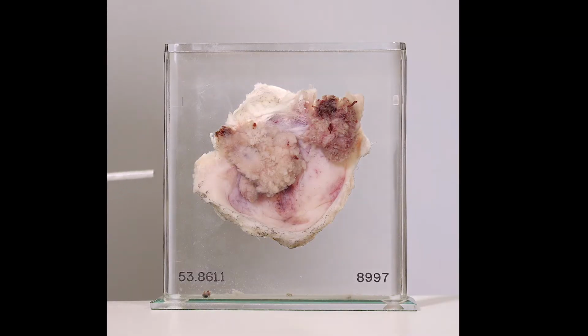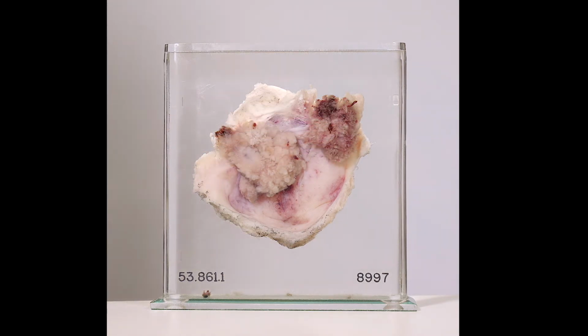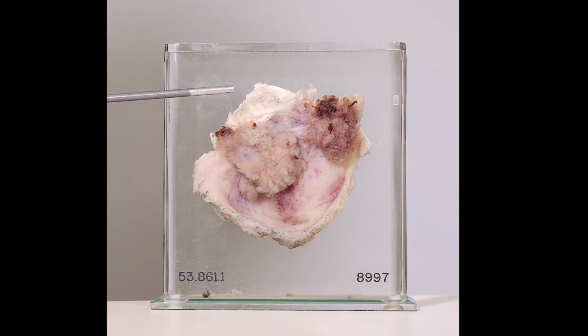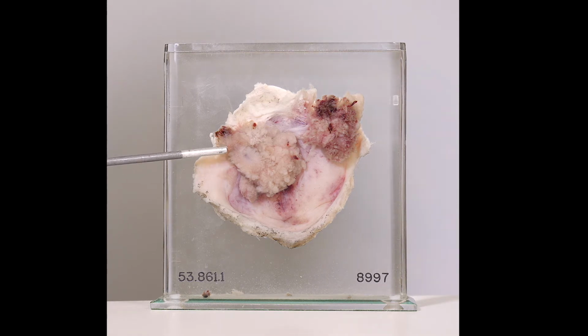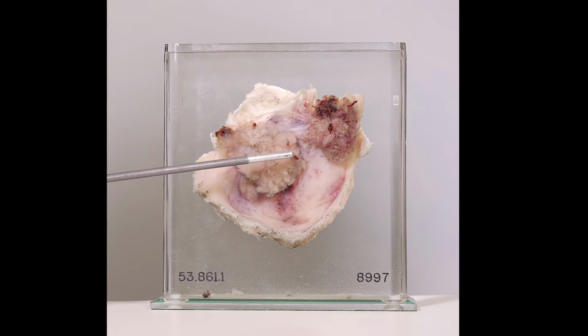The specimen has been opened to show 2 large papillary tumours, one here and one here. Both of these tumours are situated near the openings of the ureters, this region here and this region here. Notably, this tumour on the right extends across the vault of the entire bladder. Both tumours also have broad bases, here and here, and many of the processes are thick and squat.